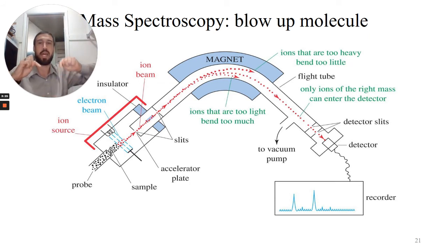Okay, we'll note that that height difference, or the amount of particles hitting, has to do with the stability of that piece. So 400 particles means that 32 mass was much more stable than that, I think I said 20 mass. And we can use that to help piece together what our starting material was. And that's kind of neat. And so, yeah, that's mass spectroscopy in roughly a little nutshell.